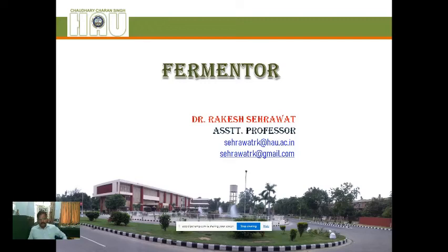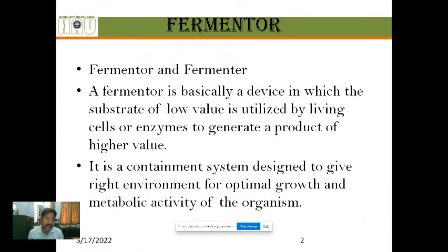Hello everyone. Good morning. So let's start to discuss Fermenter. This particular topic is useful for industrial microbiology, industrial biotechnology, microbial biotechnology, bioprocess engineering, and many more related to the biological processes. So first, it's very confusing.